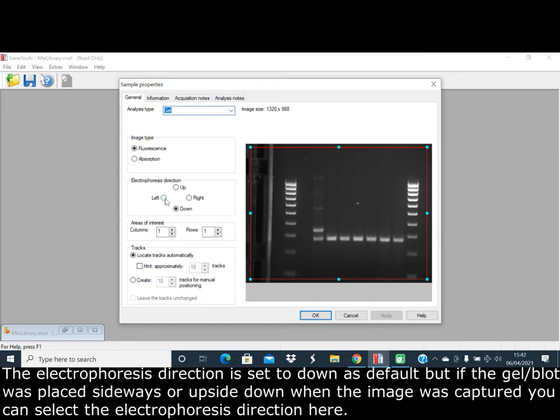The electrophoresis direction is set to down as default, but if the gel or blot was placed sideways or upside down when the image was captured, you can select the electrophoresis direction here.